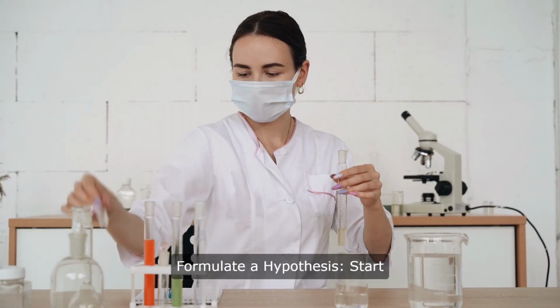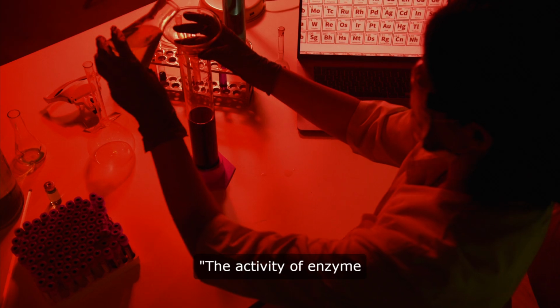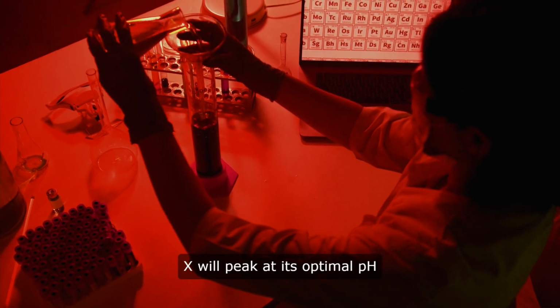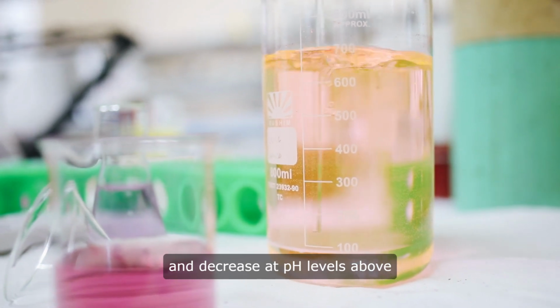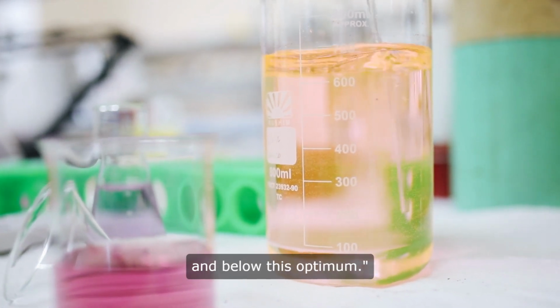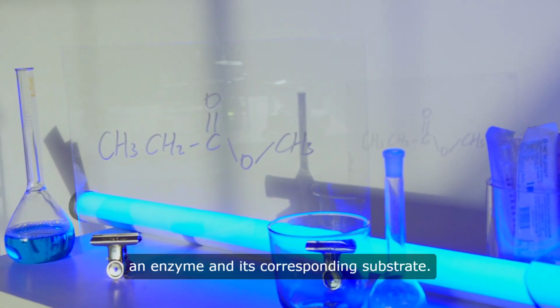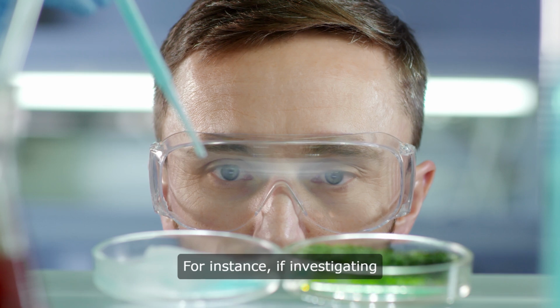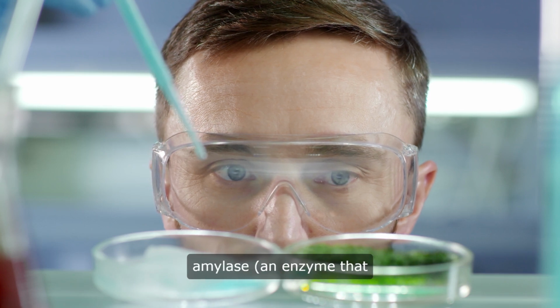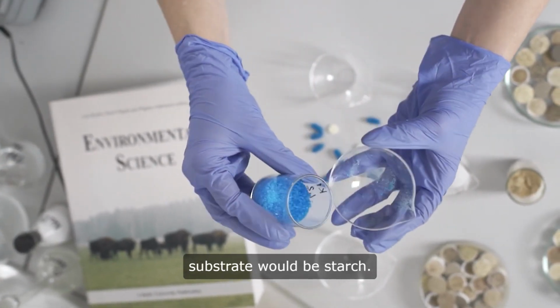Formulate a hypothesis. Start with a clear hypothesis, such as the activity of enzyme X will peak at its optimal pH and decrease at pH levels above and below this optimum. Select the enzyme and substrate. Choose an enzyme and its corresponding substrate. For instance, if investigating amylase, an enzyme that breaks down starch, the substrate would be starch.